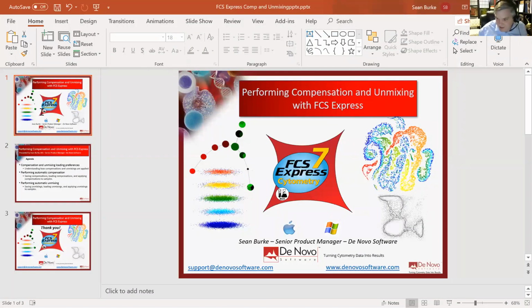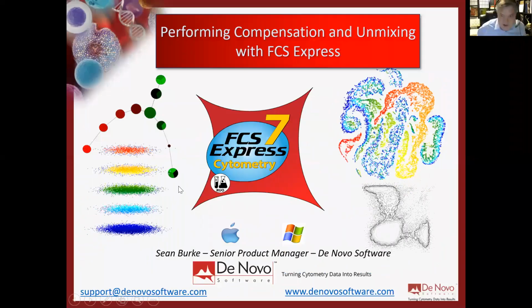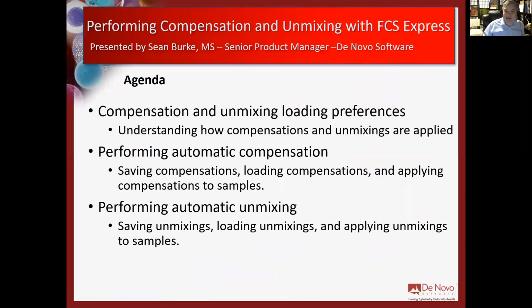All right, great. So you missed my first, most exciting slide with my name up there, but you all know my name already, so that's fine, and we'll just skip over that.